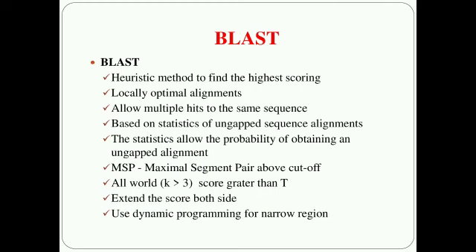Let's begin. BLAST, Basic Local Alignment Search Tool. This is a heuristic method to find the highest scoring locally optimal alignment, allowing multiple hits to the same sequence, and based on statistics of ungapped sequence alignment.